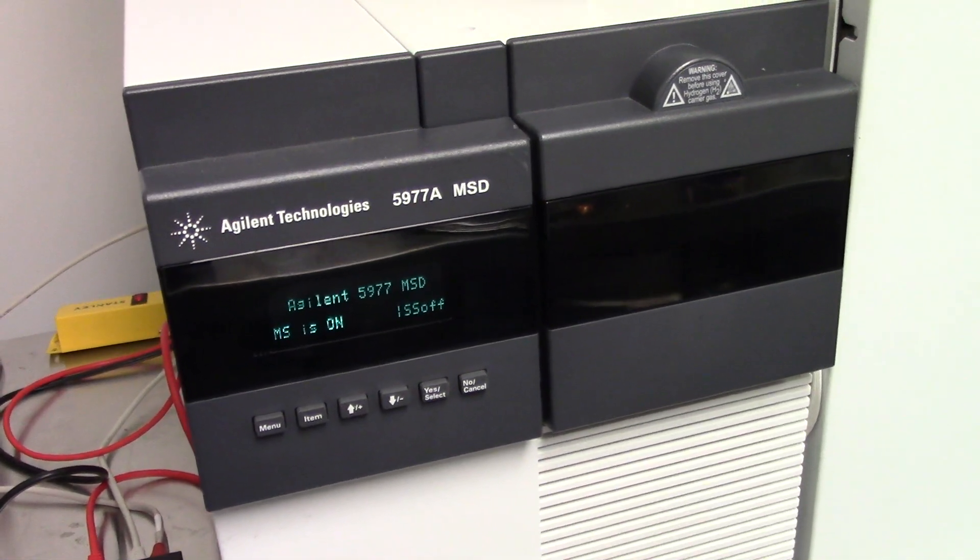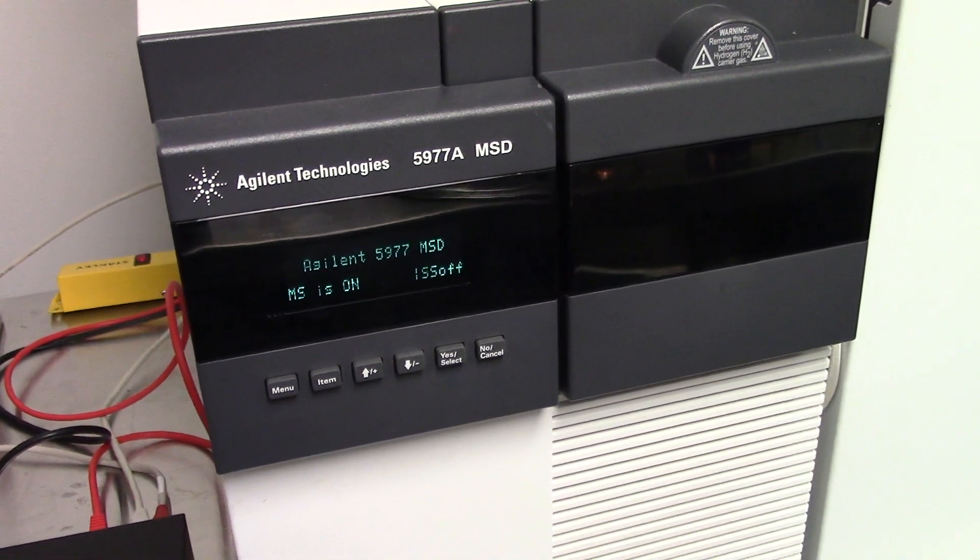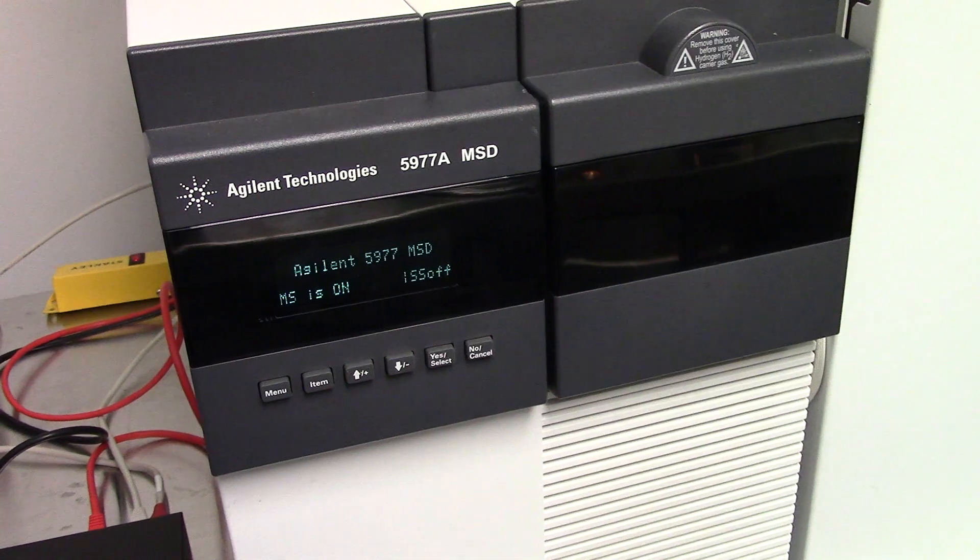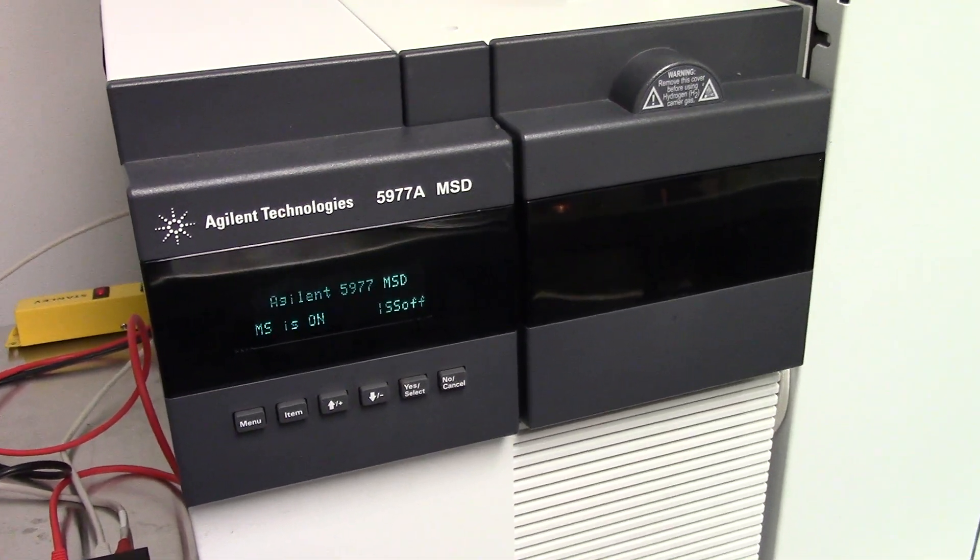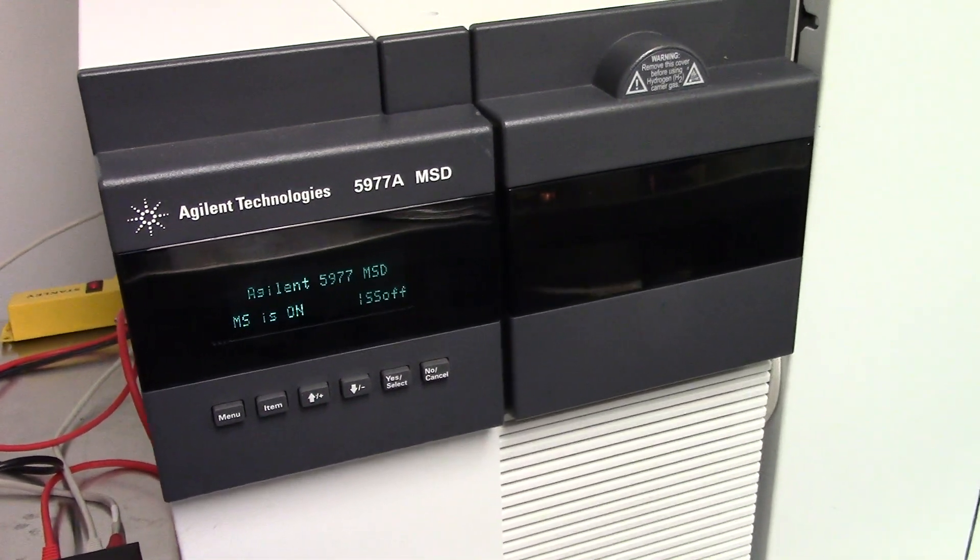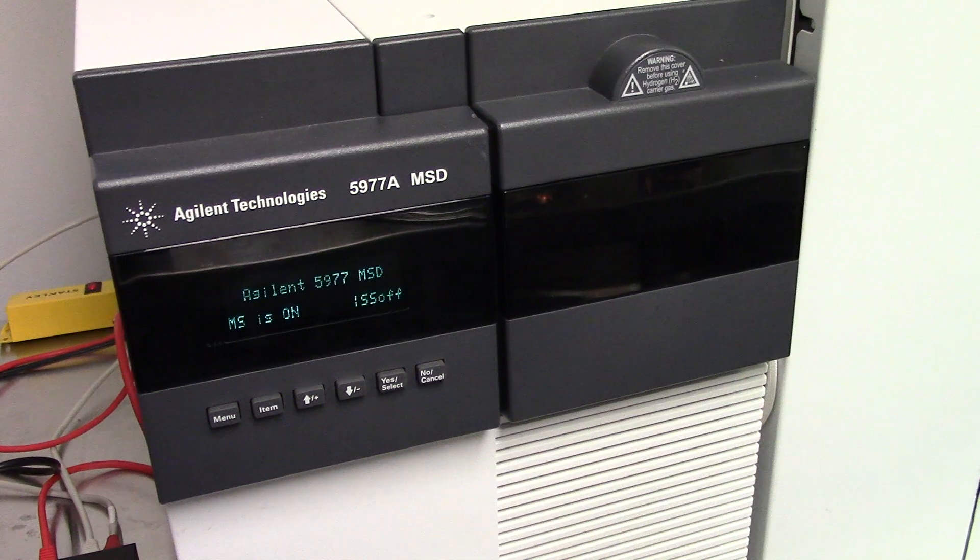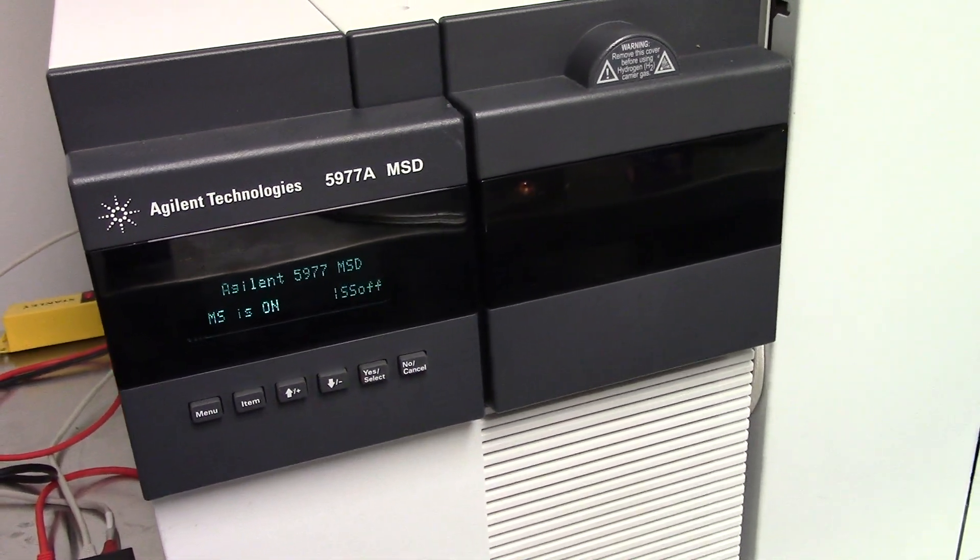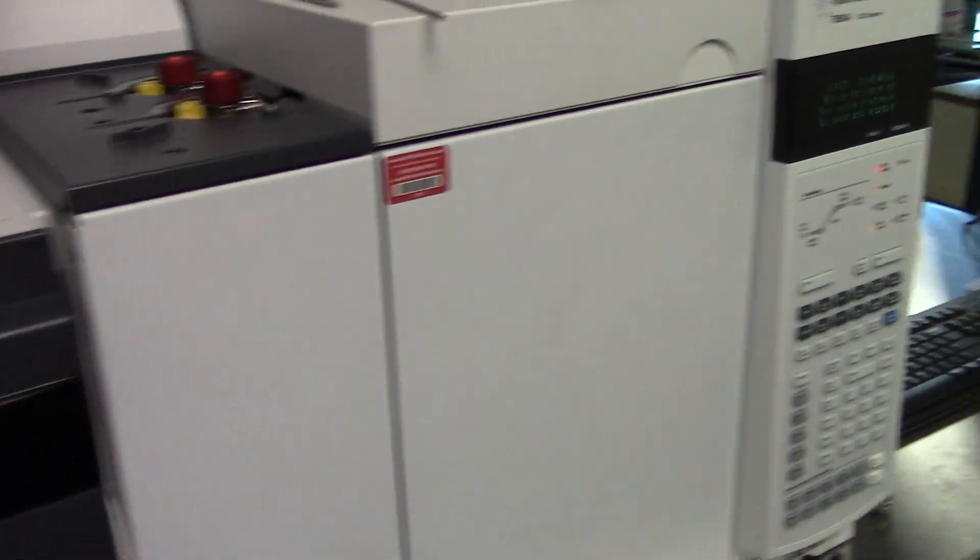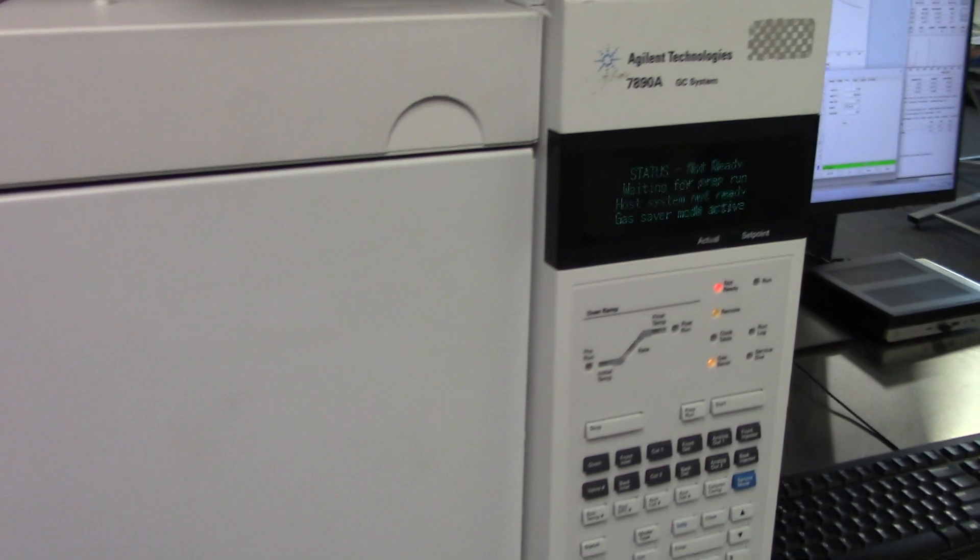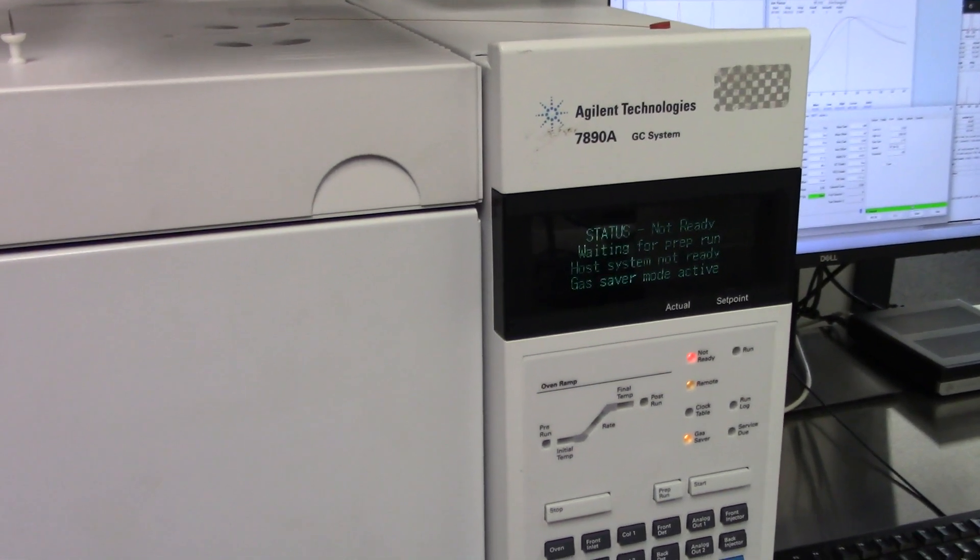Hello and thank you for joining us once again for another high-tech trader video regarding GC-MS. Today we'll be looking at a 5977A system along with a 7890A GC system.